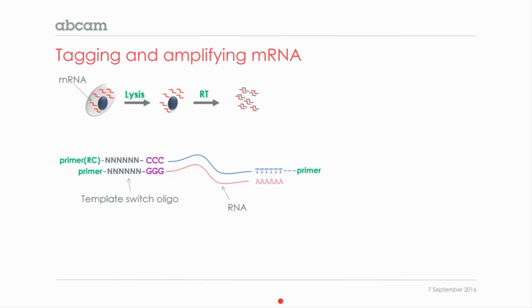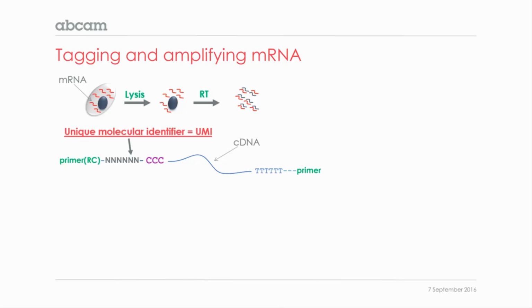And what we get at the end, if we forget now about the RNA strand and we just look at the cDNA, is basically the cDNA, which is the copy of the RNA molecule. We have the UMI, which is something we add using this template switch oligo, which is a set of 6 random nucleotides that will be the tag, the unique tag to this specific molecule after reverse transcription.